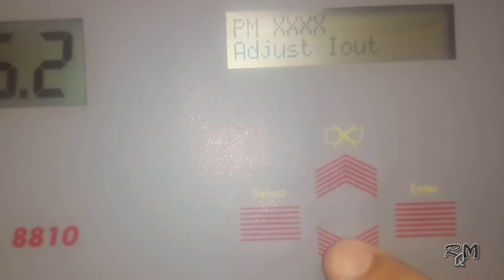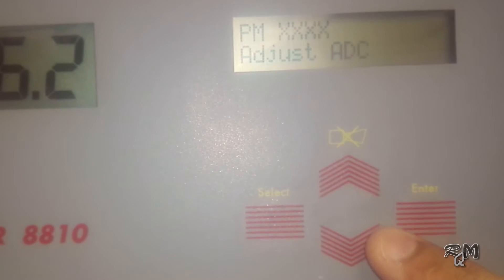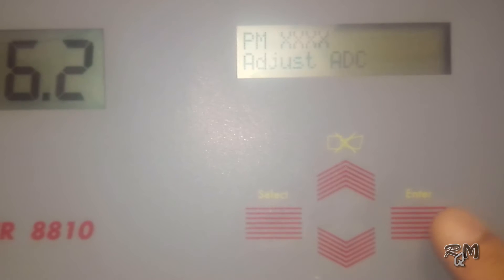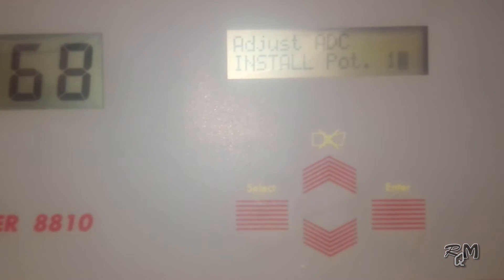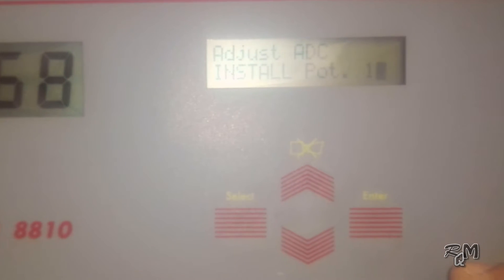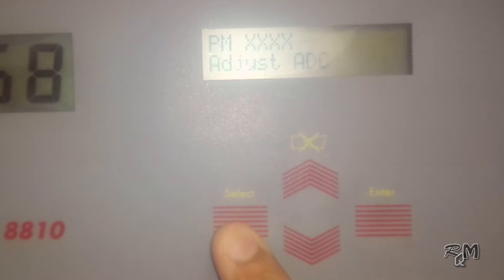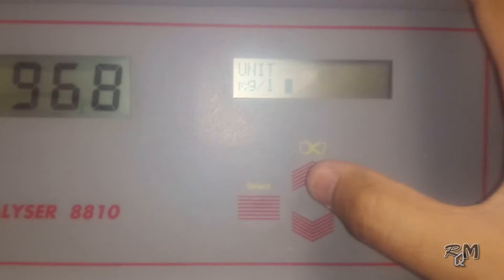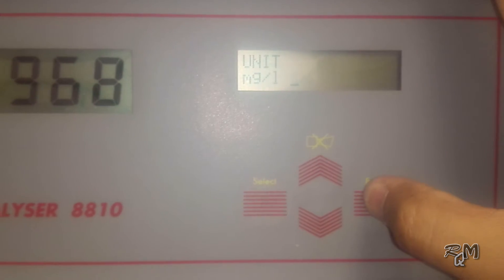The next menu is for adjustment of the ADC — this menu is used to adjust the −500 mV and +500 mV output. I will explain how to do this in another part of this analyzer. We can make the analyzer operational without this adjustment, so keep it at factory default. Then go to the unit menu, select mg unit for concentration, and press Enter.